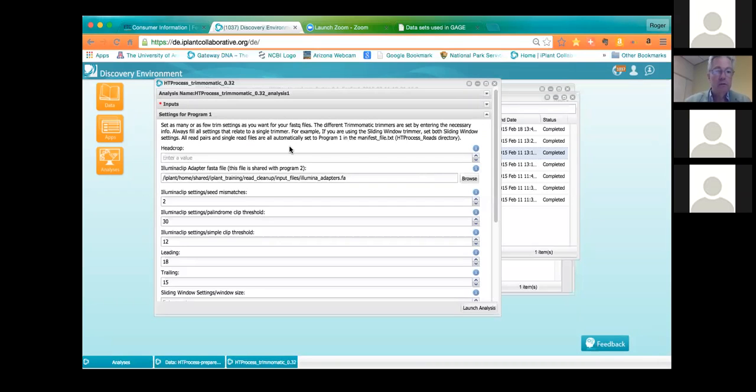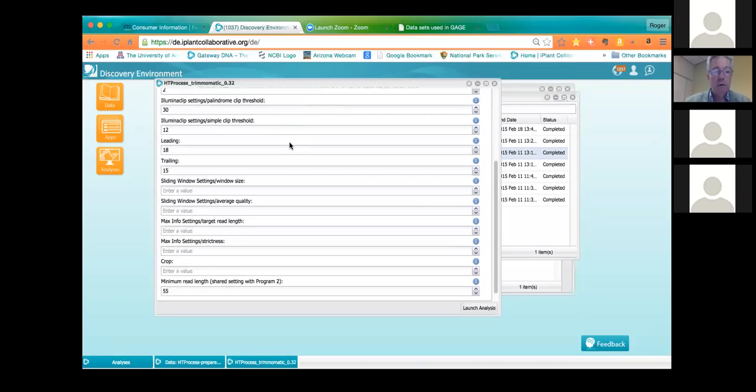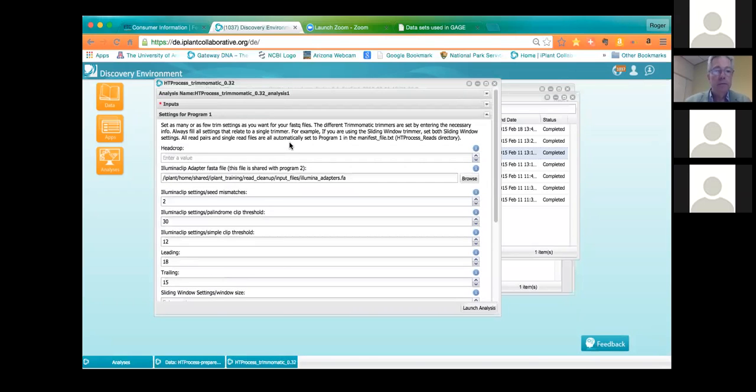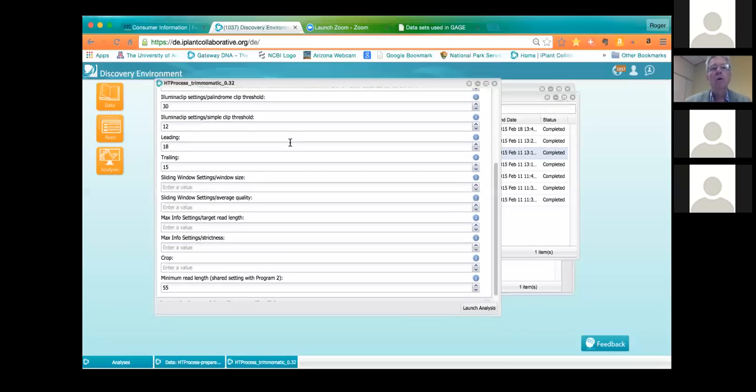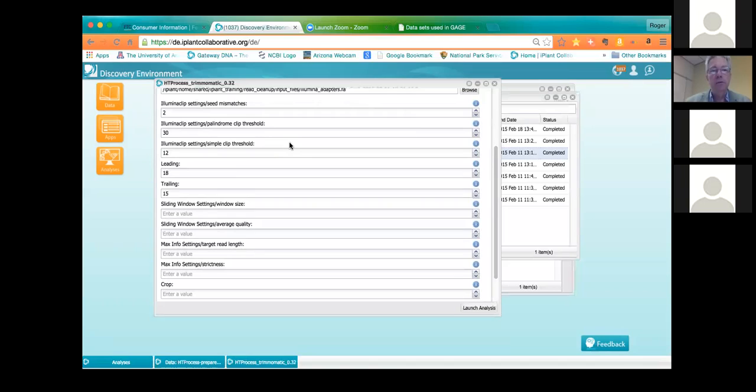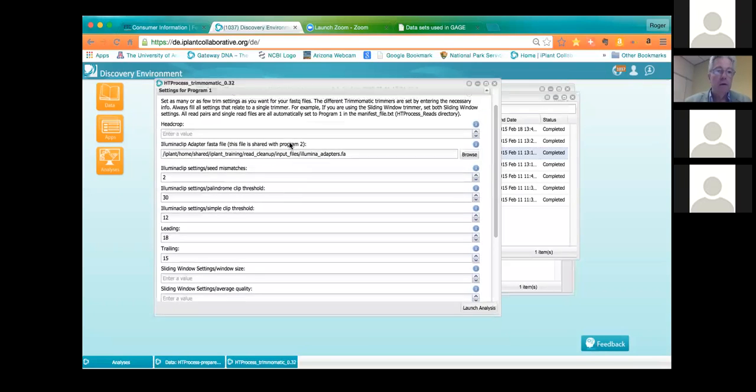And then we have all these settings for different trimmers. Do I need to use all the different trimmers? No, you don't. Pick the ones that you want to use. If for some reason you feel that your reads need no trimming whatsoever, you can probably enter absolutely nothing, but I'm not sure that that would work. But usually it's a good idea to set at least some quality threshold and put it through, just in case there are a few odd reads in there that are really bad quality but aren't showing up in the graph on FastQC.